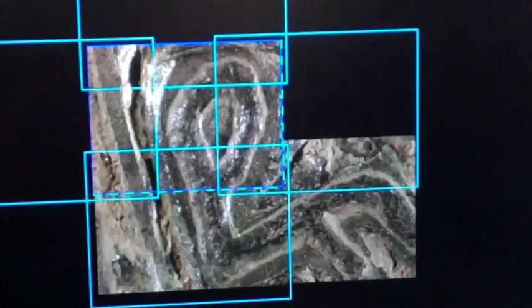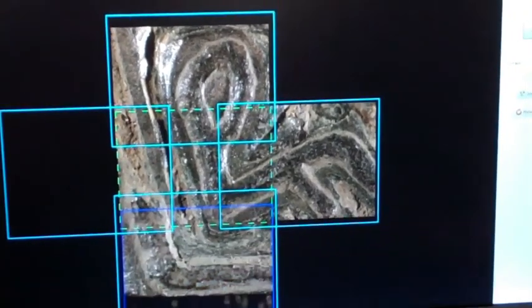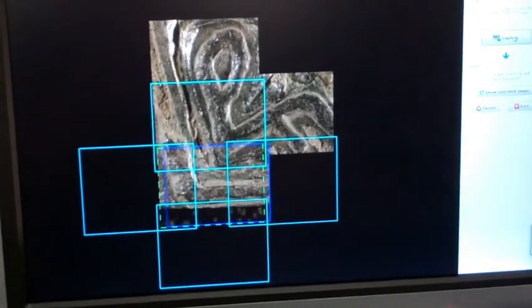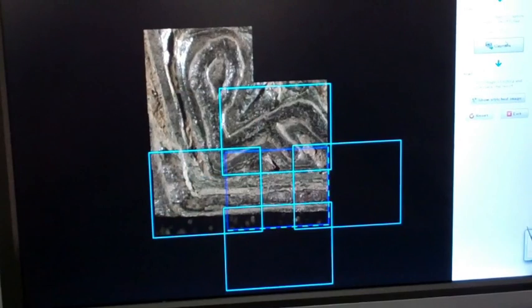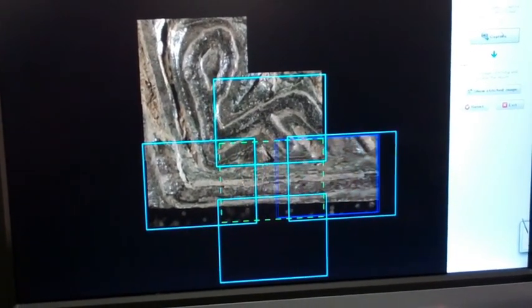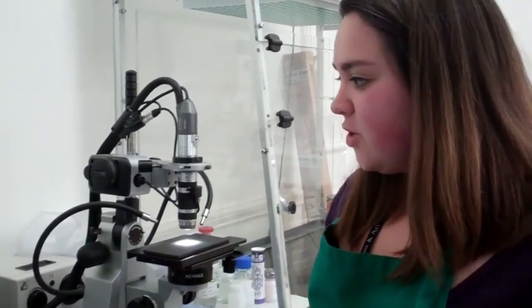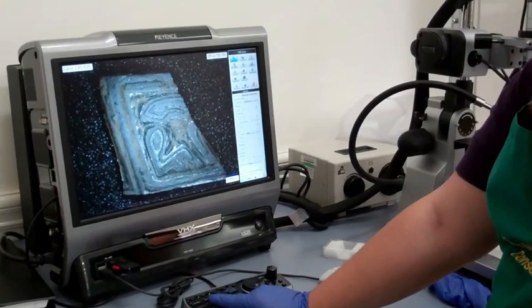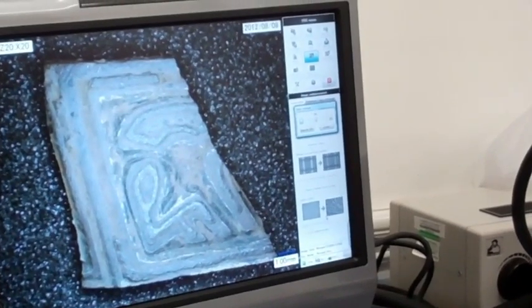What you can see on the screen now is a hundred times magnification of just one of the yellow channels of this piece. Another great thing this microscope does is stitch images together, so I can have the detail of the hundred times magnification but capture the whole piece. When we work with high levels of magnification, we need a lot of light, which when working with shiny metal is very difficult. The program can remove glare by just hitting a button, except sometimes it makes the object look much different than it does in real life. So if we do remove the glare, we're sure to note it in the file name or our notes.